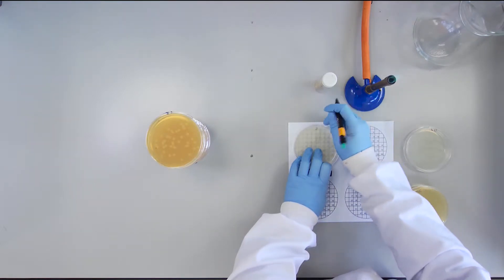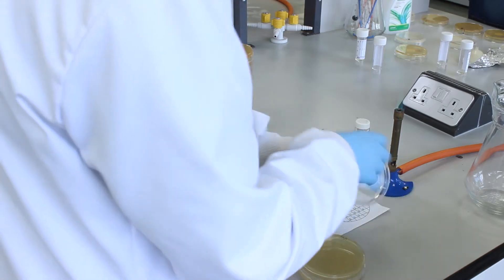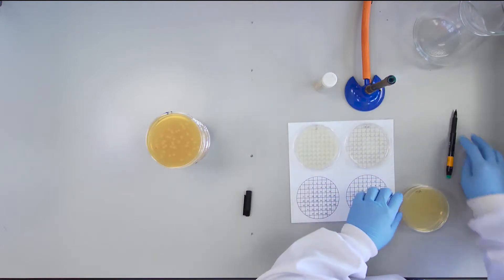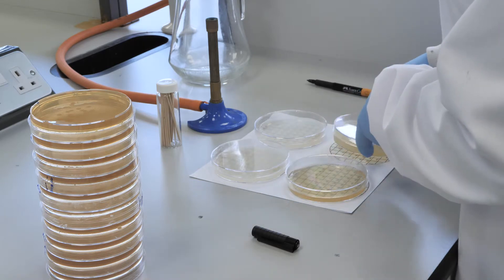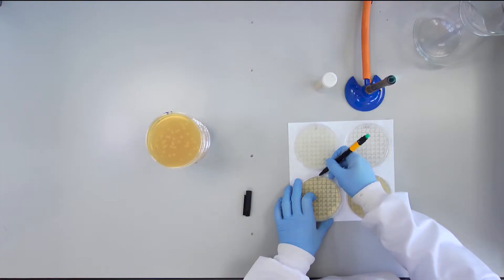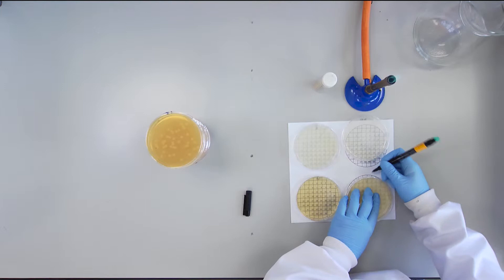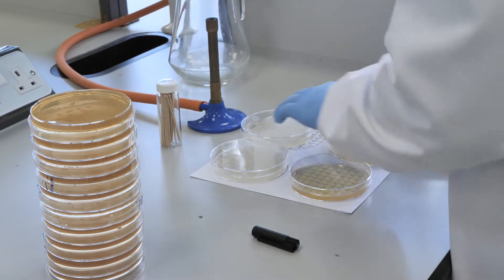It is up to you to decide the correct order of the plates to be used. The plates are laid out here in a random order to show the procedure for the replica plating. Once you have decided the correct order in which you will inoculate your plates, mark a line on the side of the base of each plate at the 12 o'clock position and lay them out on the grid sheet facing upwards. It is important that you can lay the plates out again in the same orientation after incubation.